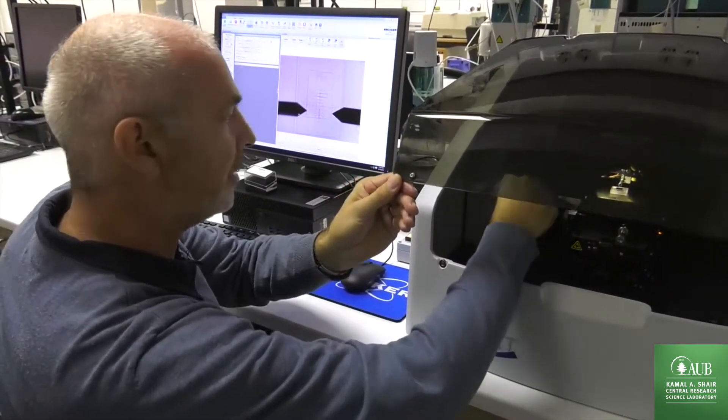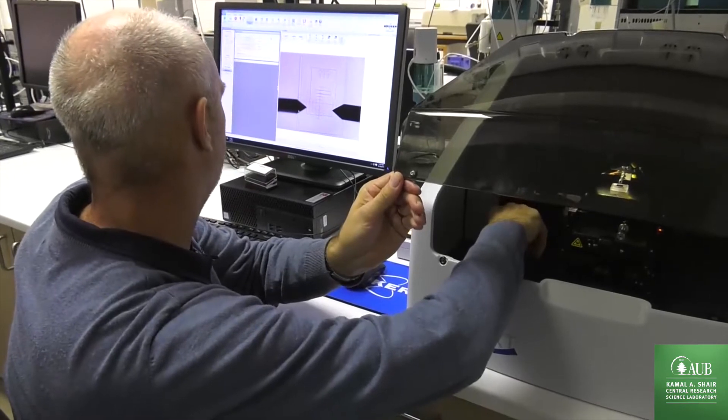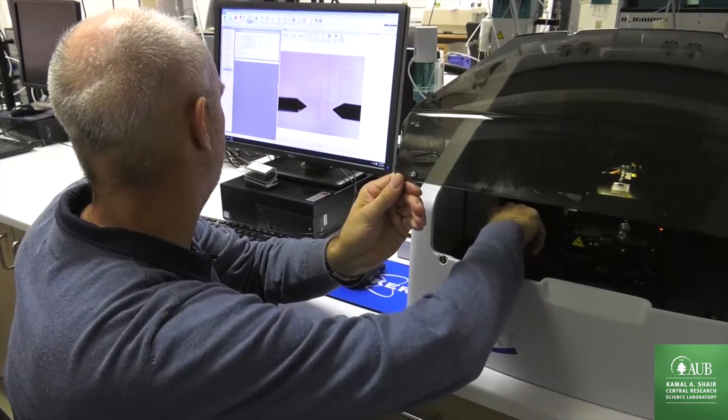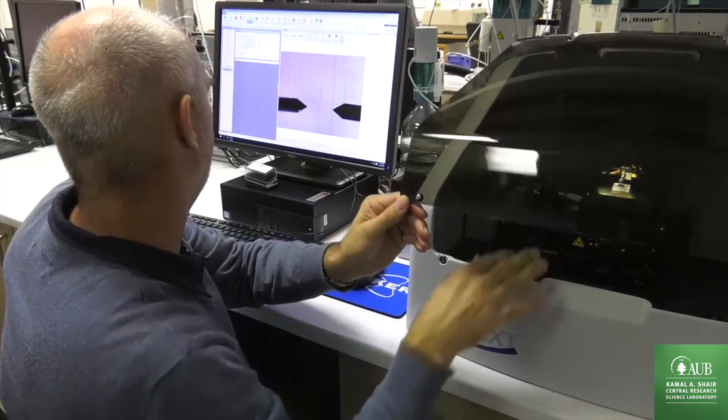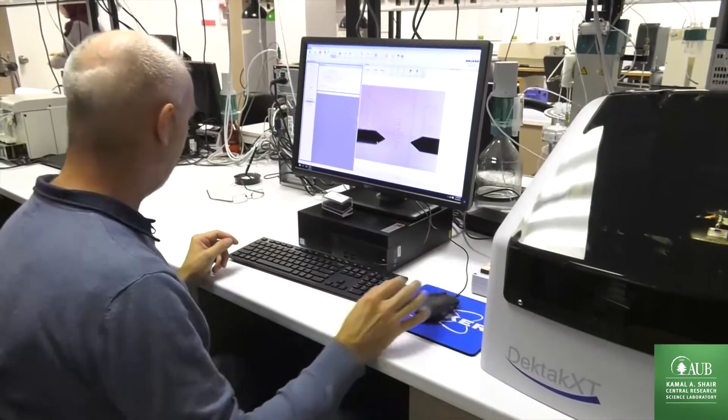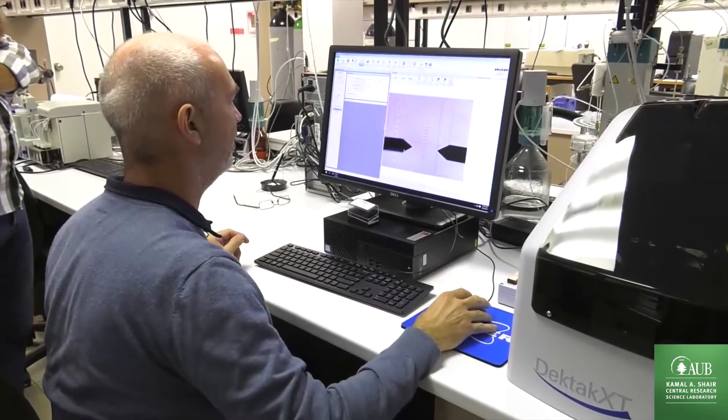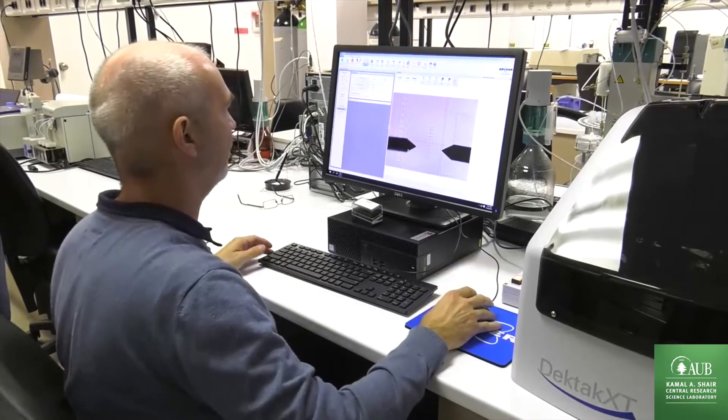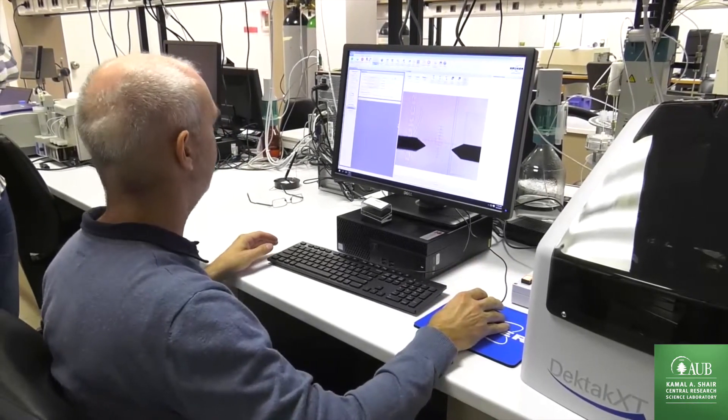Let's navigate to another spot. Let's just say we measure the roughness here, whatever it may be. I will have to look at the table and the mean, no probably not, but probably all the settings are correct.